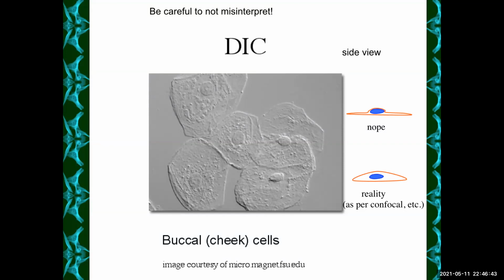Okay, so here's a picture of cheek cells under DIC. They look just like what you saw in the Meiji, right? No, I hope not, because you shouldn't see this on the Meijis. You had to stain them to be able to see them, with methylene blue. The nice thing about DIC, and you can do this when you get back to campus, we have a bunch of scopes with DIC on them, is that it's a contrast generating technique. You don't even have to stain them. You just put them under the scope, and it uses physics, and it gives you this beautiful image.